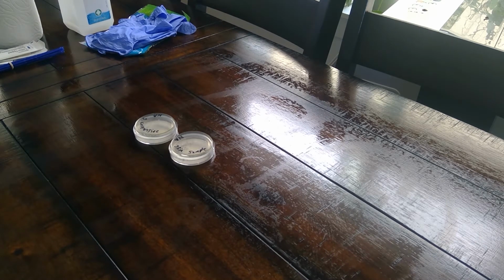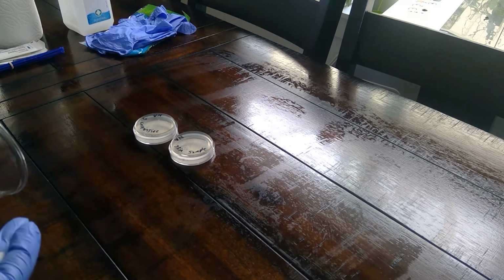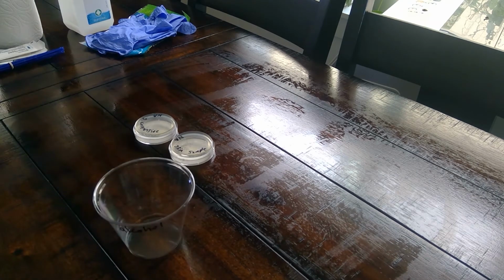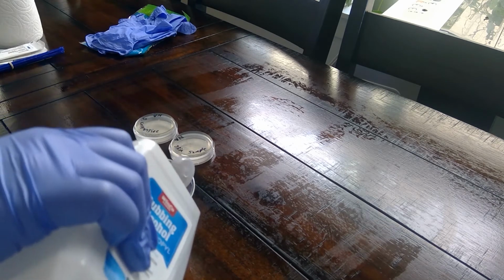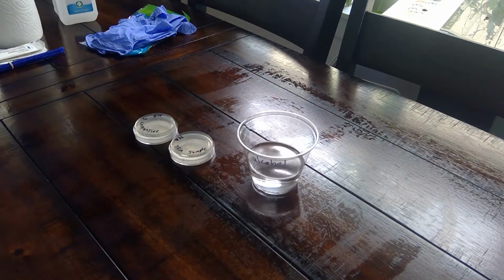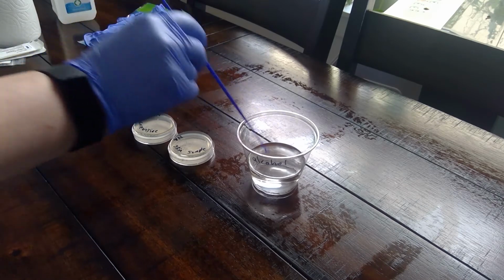Step 7, fill a small disposable cup half full with alcohol and place it on the work surface. I'm going to try to conserve my rubbing alcohol, so I'm glad I got small cups. You want to label it so you know what it is. I think in another spot it asks you to do bleach as well. So that's my alcohol. And then it says to put 2 inoculation loops in the cup of alcohol to sterilize them. You'll want to put the loop side in the alcohol.